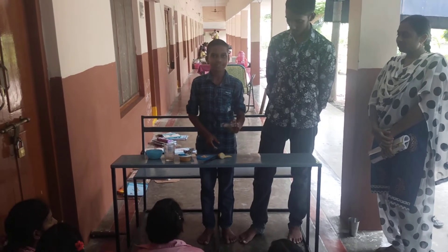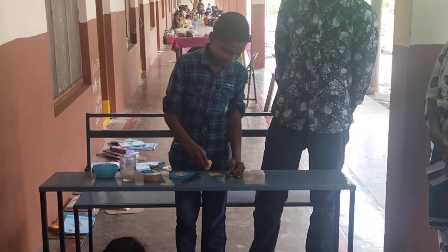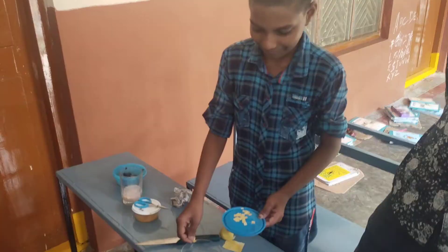First I take the watch glass and a lemon juice. Two drops of lemon juice and a watch glass.